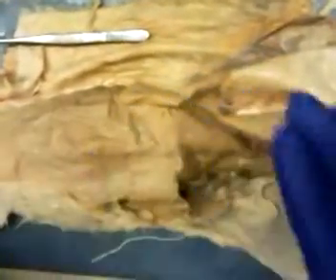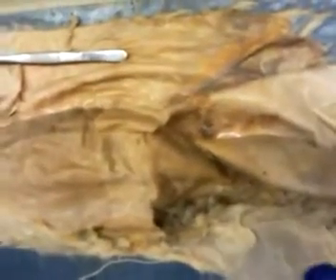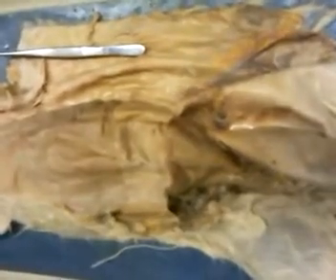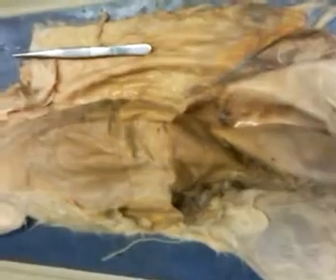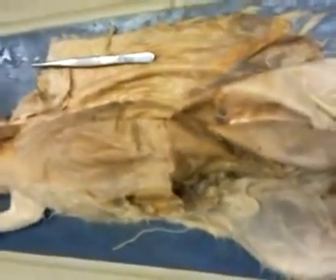Now, as you're doing this dissection, and I think it'll take you the rest of the period to do it well, because it's quite ticklish, why on earth would your abdominal muscles be such thin sheets with fiber directions crossing over each other, 3 layers? You can't rip them apart. How might they rip apart?